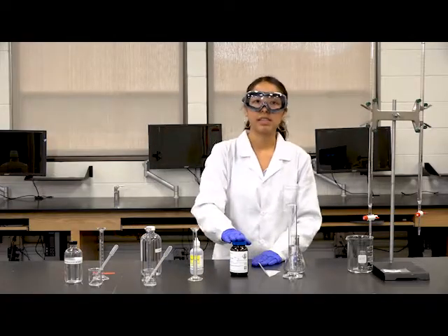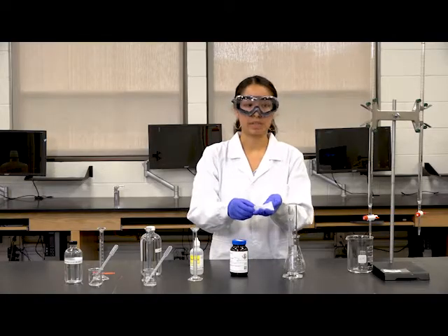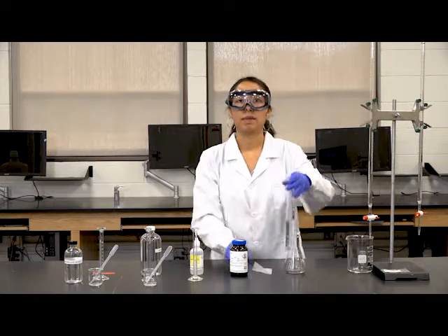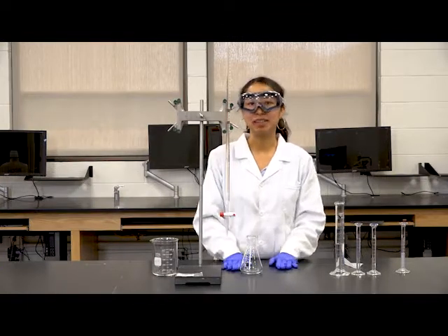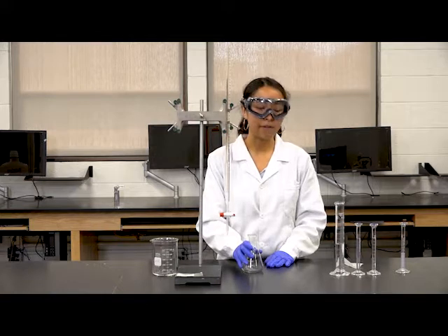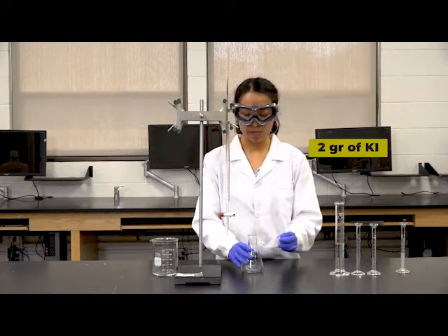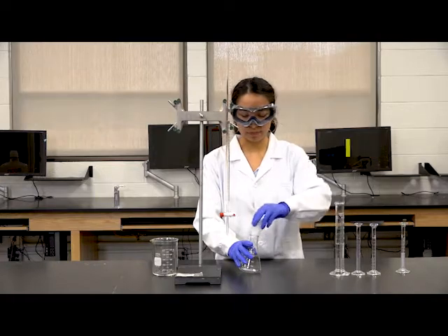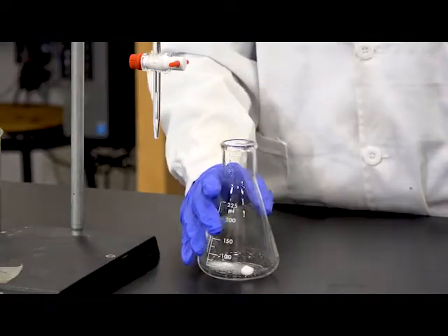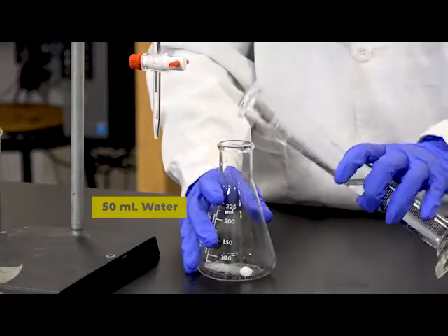For your potassium iodide, you're going to be weighing on a weighing paper or a weighing boat 2 grams of potassium iodide, and you're going to be getting a big graduated cylinder with 50 ml of water. Once your burette is ready, you're ready to start your titration. Get your Erlenmeyer flask. Then you're going to get your 2 grams of potassium iodide and put them inside the Erlenmeyer flask. Next thing to do is to grab the 50 milliliters of water, and add it inside the flask.